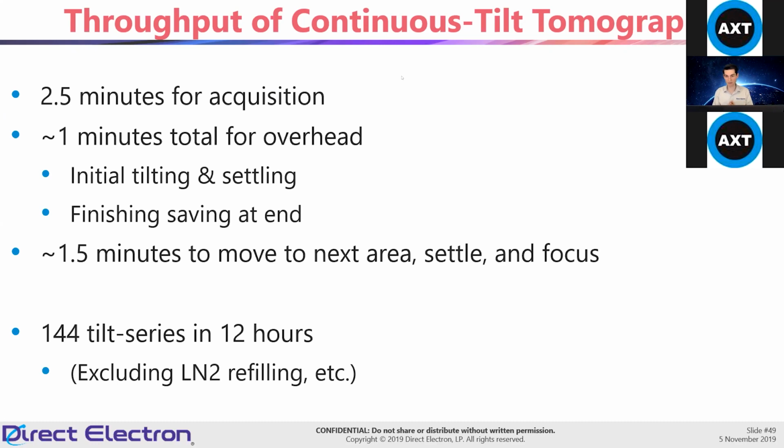So in about 5 to 6 minutes, you can take an entire tilt series and collect the next one right after that. It's about 144 tilt series in 12 hours. Keep all of your grad students and postdocs busy for months and years.